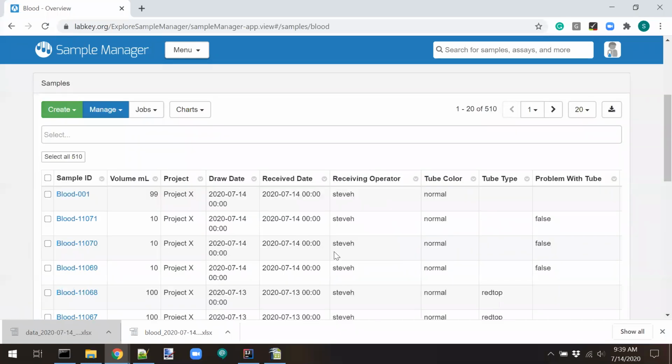I showed you a bit. I can do filters and sorts and searches on this grid. And I can also add things to the grid. You know, we added that exhausted tab, we added the exhausted field and whatnot. Now, there are some other tools that you can go deeper with, but it is really part of the LabKey Server offering, and so I don't really want to get into that too much, but the answer is yes, if you explore one of our more expanded offerings.